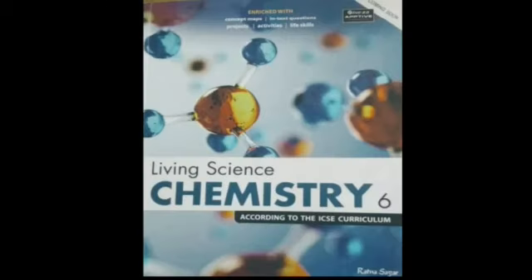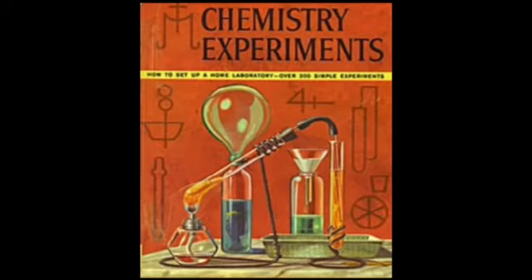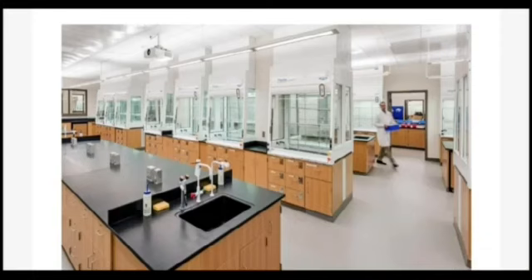Second, never forget to bring with you to the lab the textbook for consultation and the practical notebook for recording the results. Third, read the experiment to be done in advance and thoroughly understand the procedure. Fourth, always keep the apparatus and working table clean before and after use.